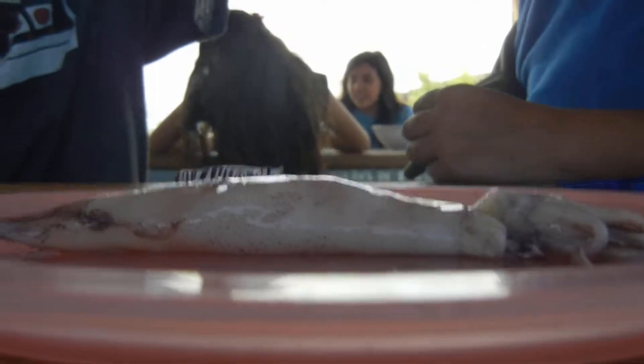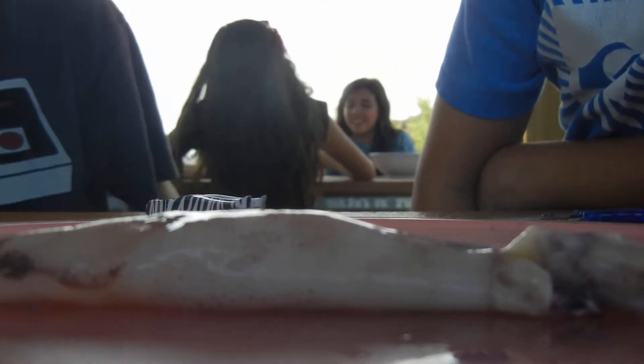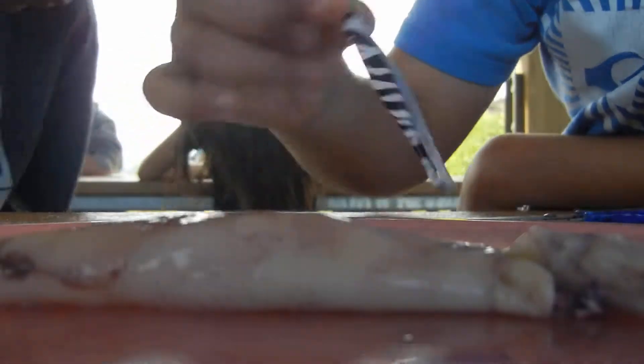Alright, so guys, did you find the beak? Yeah. Good job. It's so small. This is the beak, guys. That's okay, but you guys saw it, right? Yeah. Alright, so we've talked about how squids eat. Let's talk about how they see.